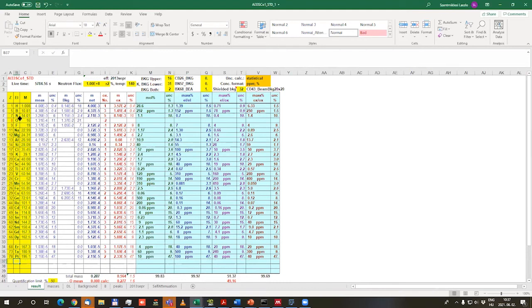The other trick is the oxygen. Oxygen is very poorly measurable in our case. It has a very low analytical sensitivity, and as this is an oxide, a geological material, we can safely assume that it is in a fully oxidized state, and we can compute the oxygen content of the sample based on the oxidation numbers and the stoichiometry.